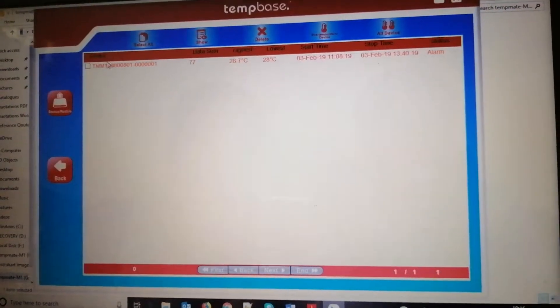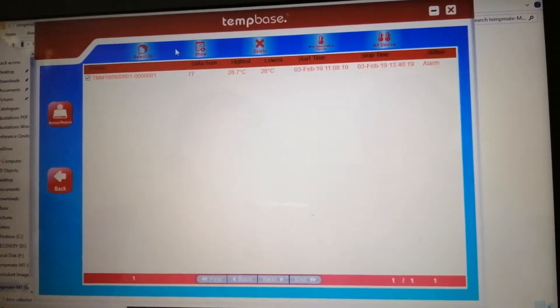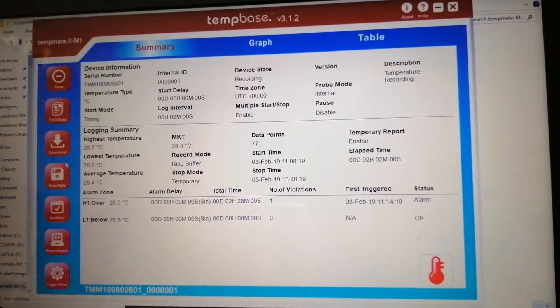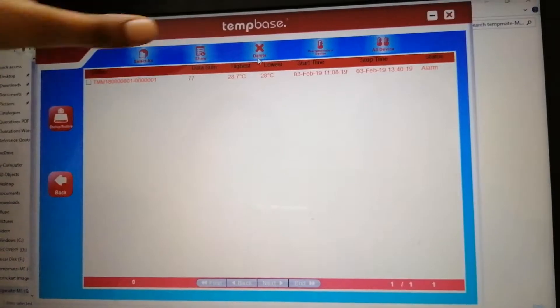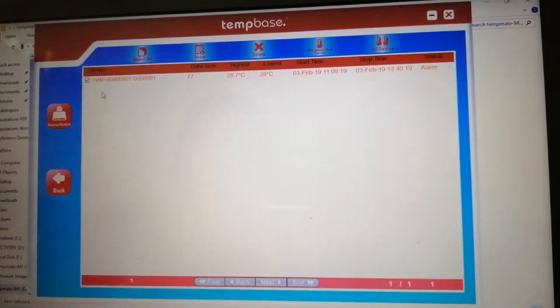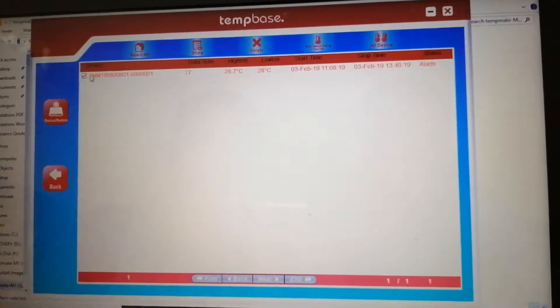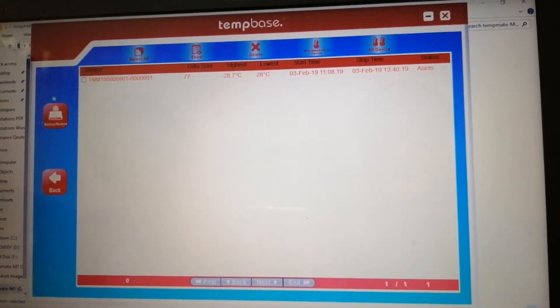Coming to the database, this is the summary page shown previously. If you want to delete data you can delete it here. You can select the number of devices — whichever devices you have — and delete them here. There is also a restore backup option; if you delete data here it will restore from the backup.